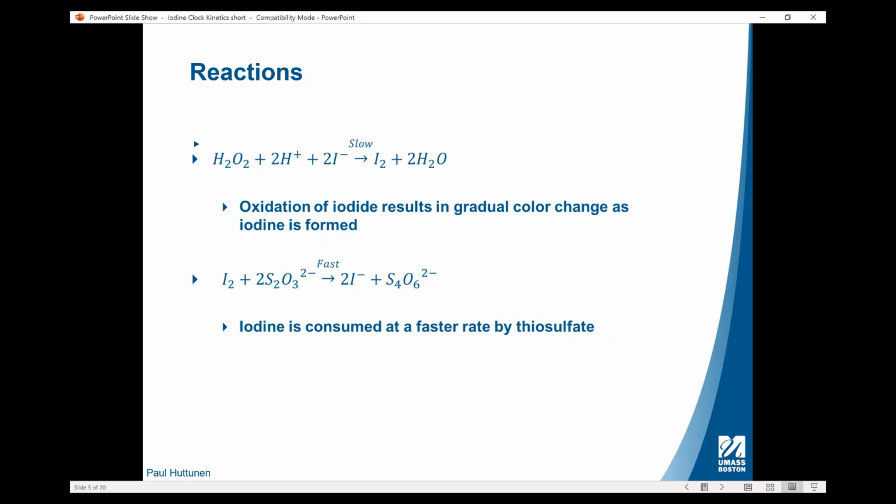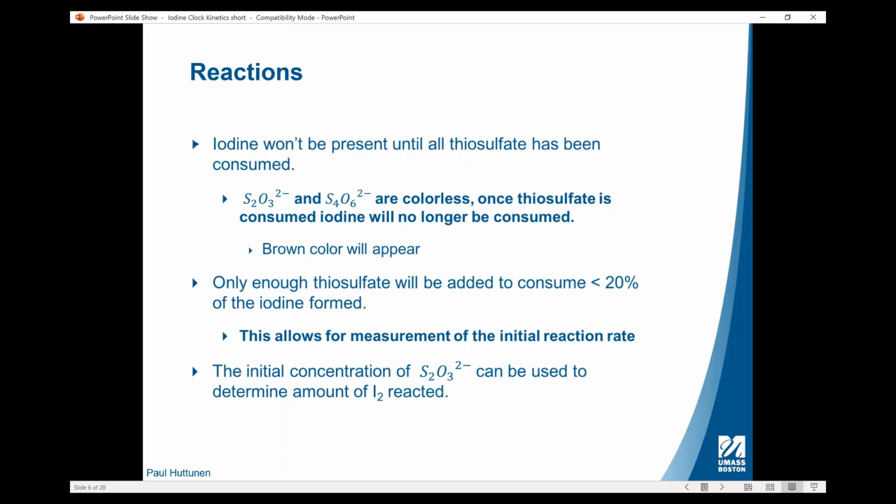So why are we doing this secondary reaction? Let's go to the next slide. We want to know exactly when iodine will be present.